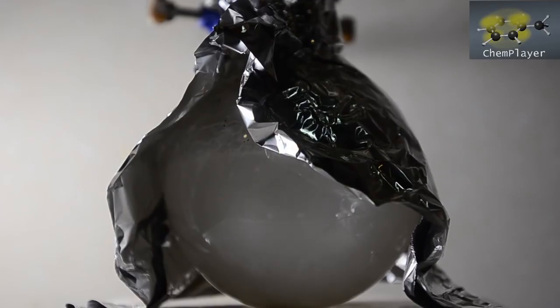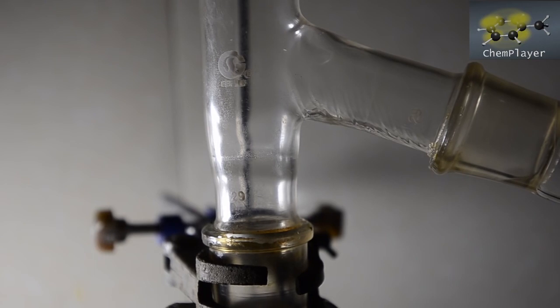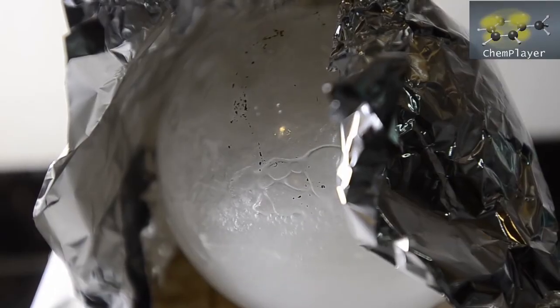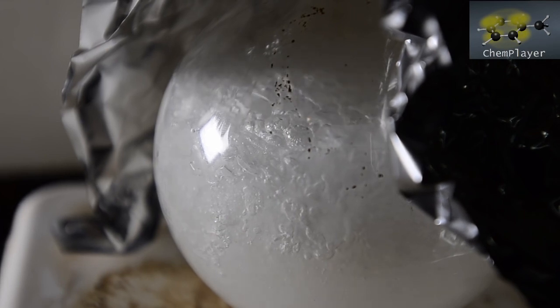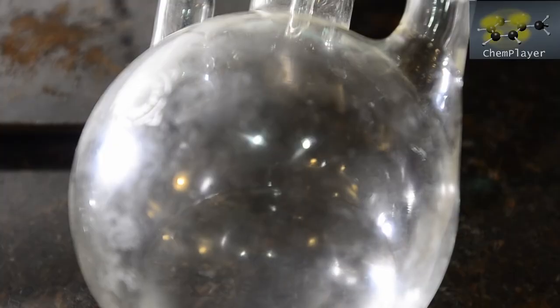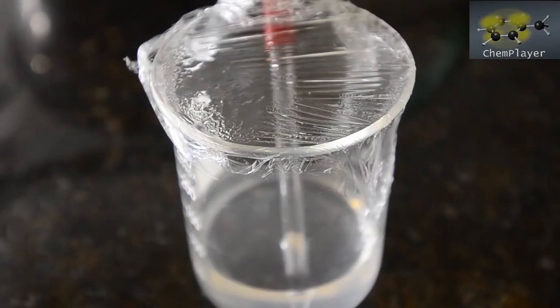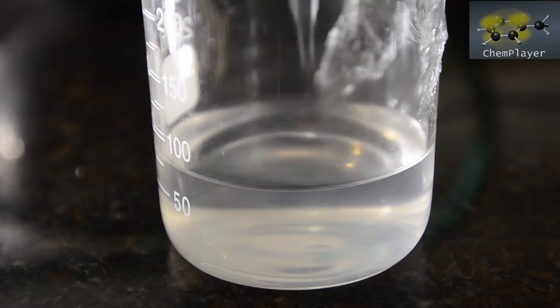Go very slowly or your mixture will for sure boil over. This is why we recommend using a larger flask. To start with, add just a few drops at a time, then work up to a ml, then a few ml. You can see the white sodium hydroxide forming. During this process, distillation of the ethanol is occurring, and this takes some time. To add the first 100 ml of water and collect the first 200 ml of ethanol took about 2.5 hours in total.